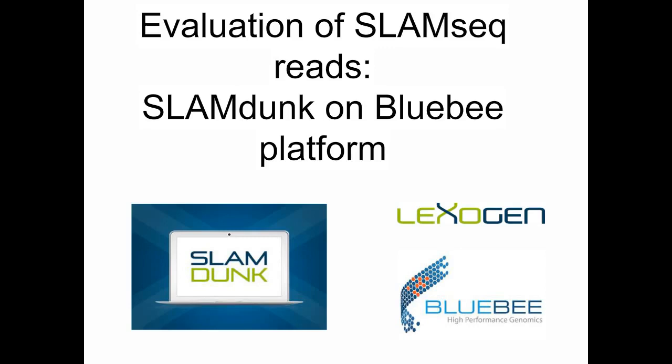So this means that you can multiplex more samples together, although you might need a high amount of read counts in the 20 to 30 million read range if you're looking at these short time course time points. This is still going to provide you with a significant advantage over a traditional mRNA-seq where you may need up to 100 million reads.